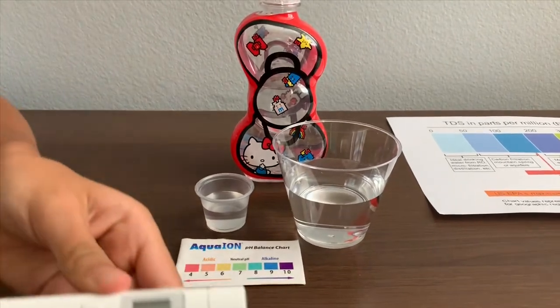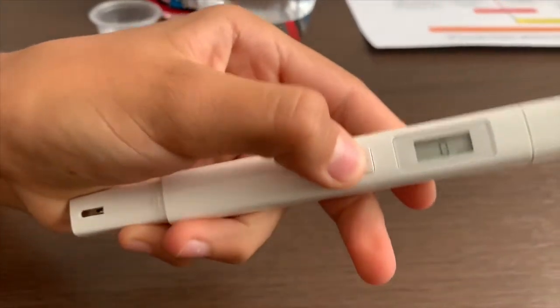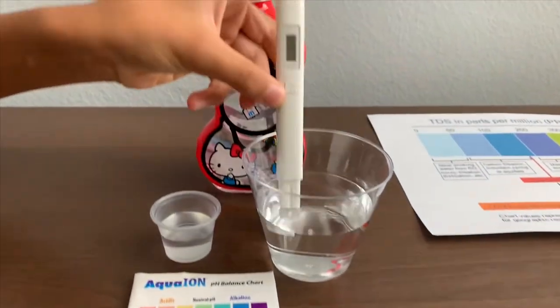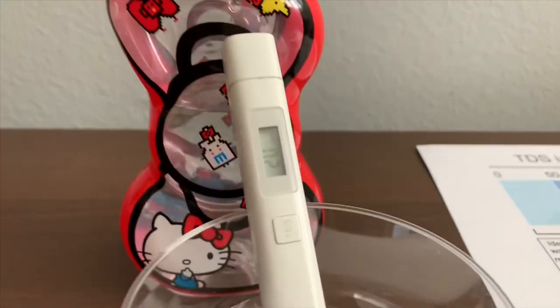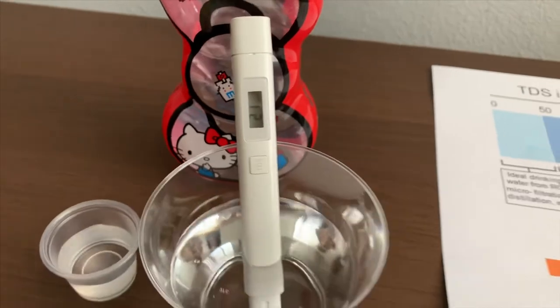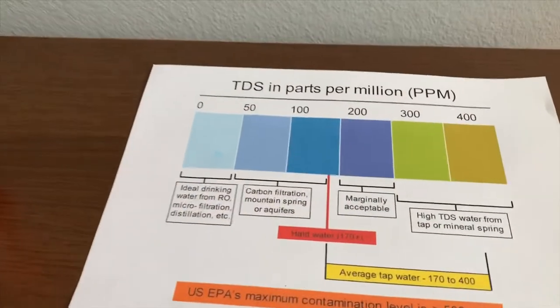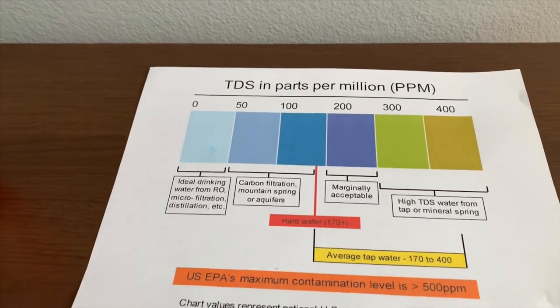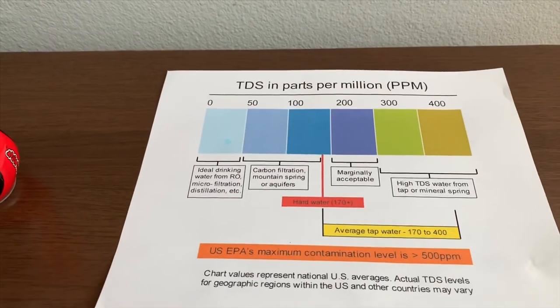First we are going to test the TDS level. Turn on the TDS tester and make sure it says 0. Put it in and let's wait. It is 21. That is microfiltered water.